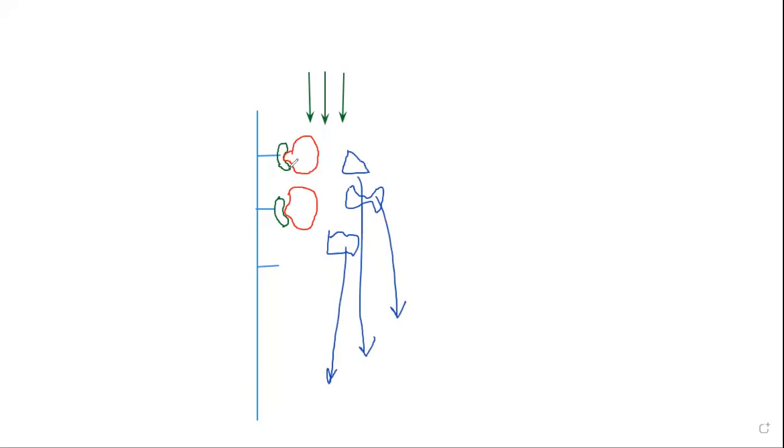Is that clear to everybody? Yes or no? Yes, sir. Okay. So now the next question is how to elute this. Whatever is sticking to the column, the desired molecule, how can we remove that from the column? And for that, we again have a very interesting strategy.